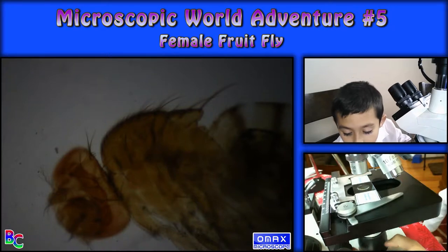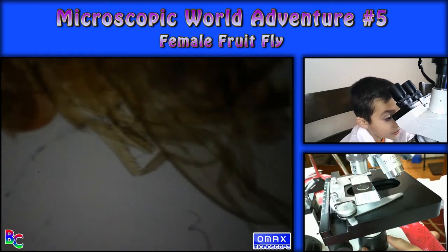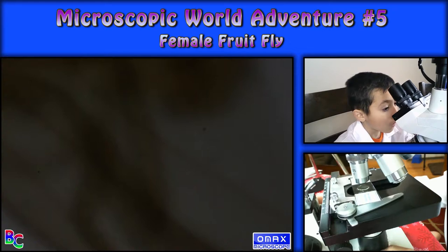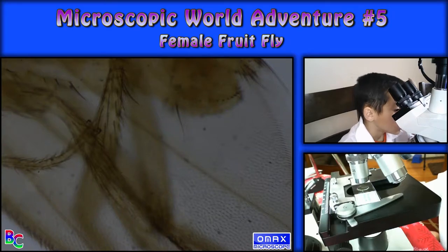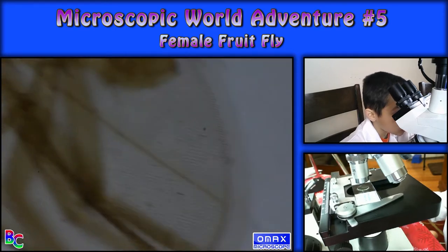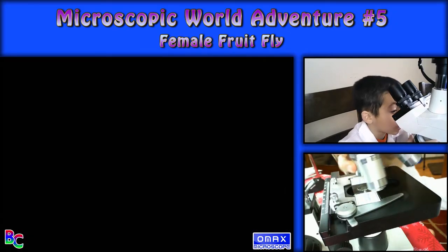Actually, I think this is a fly because it says fruit fly female. And I can see the wing — I can zoom in on that wing. Remember from one of the episodes that had a fly wing? Yeah, that's actually it. That's the same texture. Wow, I did not know that it would have the same.